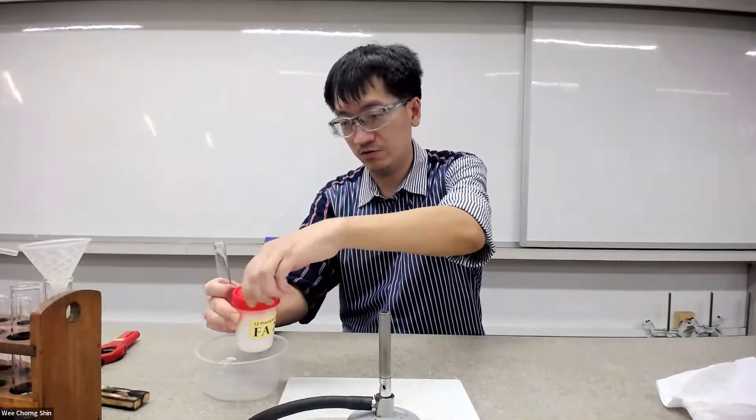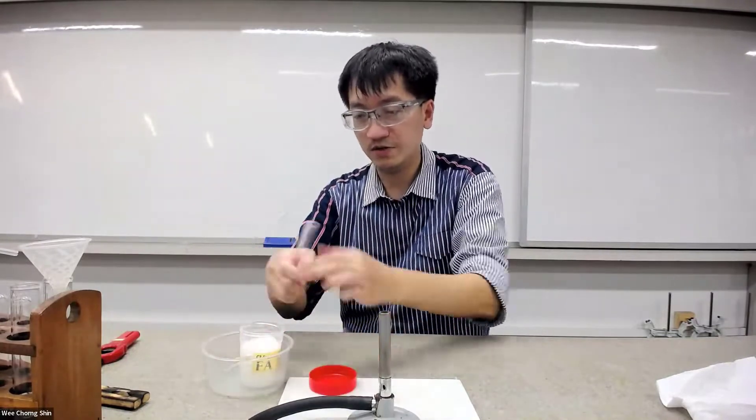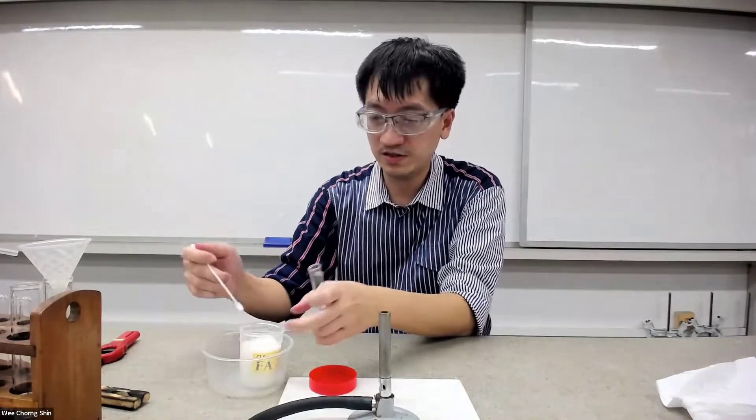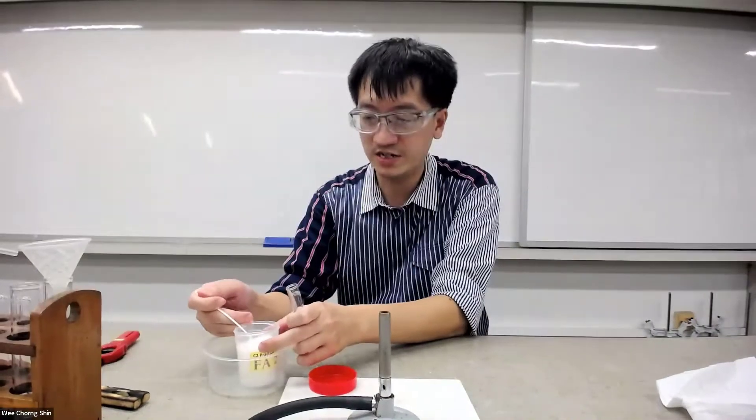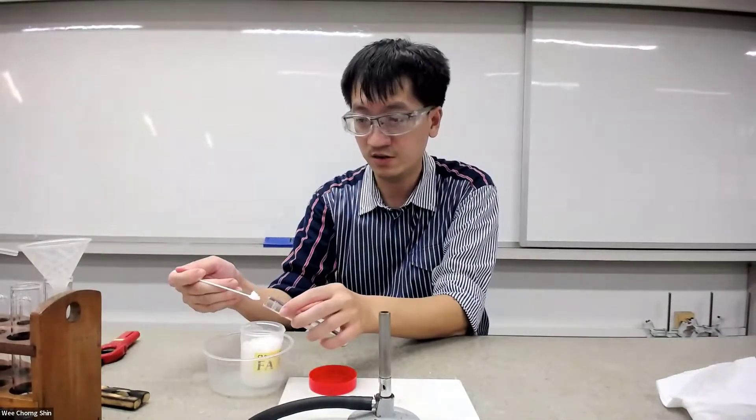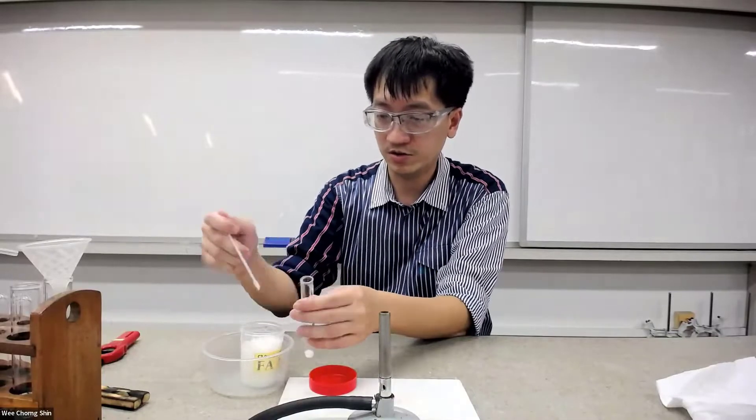I'm going to load it with some FA2 first. You can see that it's actually a white solid. I'm just going to load some in.